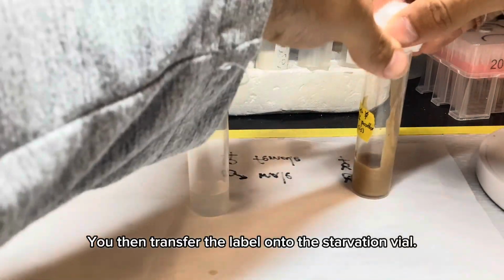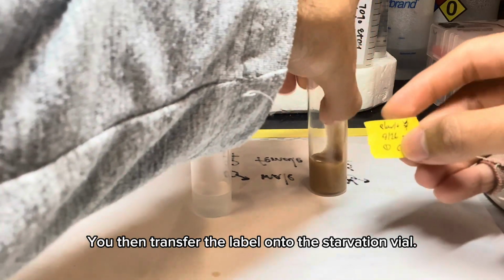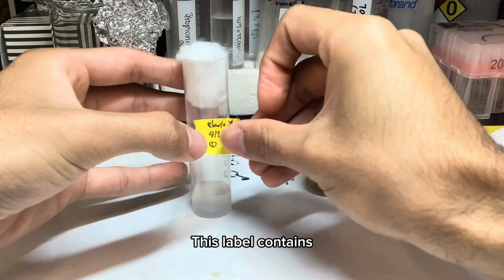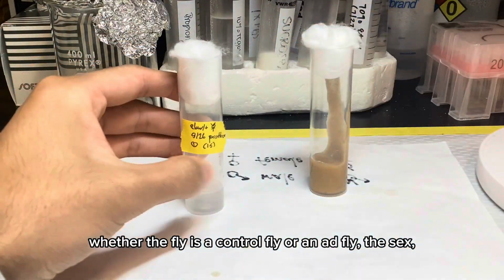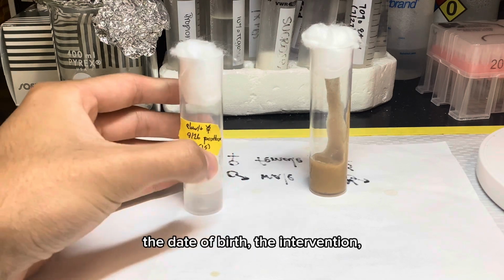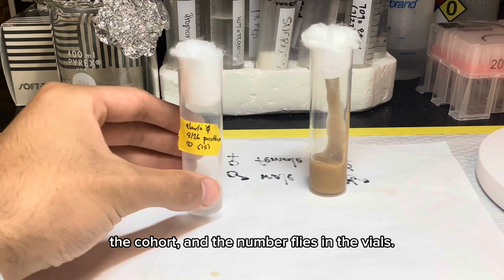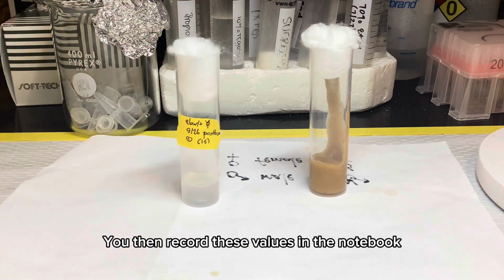You then transfer the label onto the starvation vial. This label contains whether the fly is a control fly or an AD fly, the sex, the day of birth, the intervention, the cohort, and the number of flies in the vials. You record these values in the notebook.